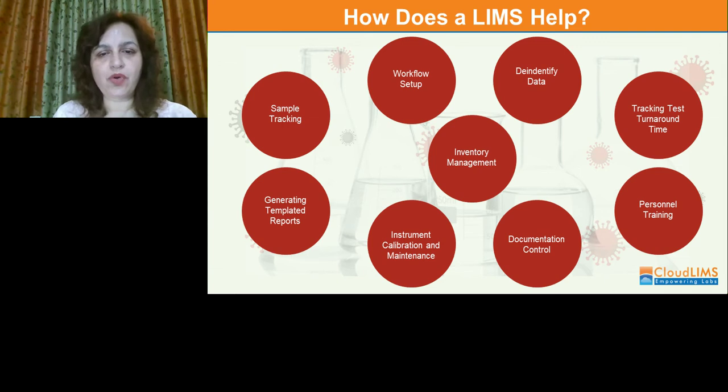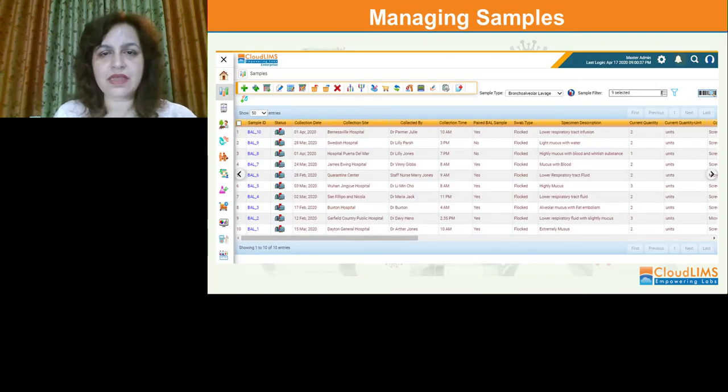It can generate reports and meet compliance. And we shall discuss these in the upcoming slides. So how does LIMS manage samples? Now, laboratories are receiving a deluge of samples in these times, and managing the samples is an onerous job for them. With the LIMS, it may not be.